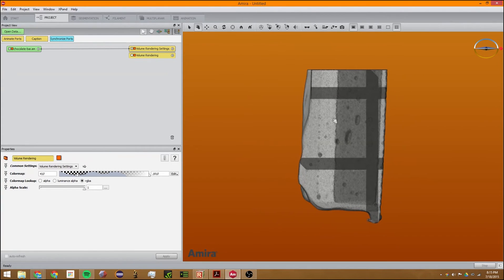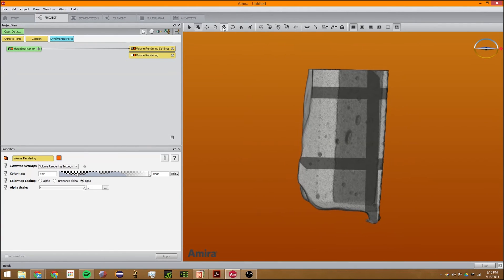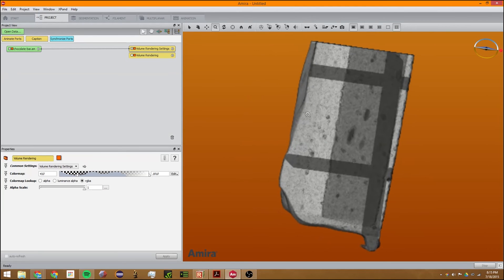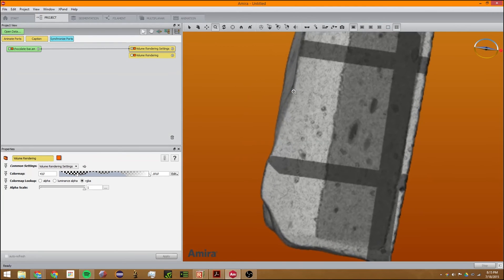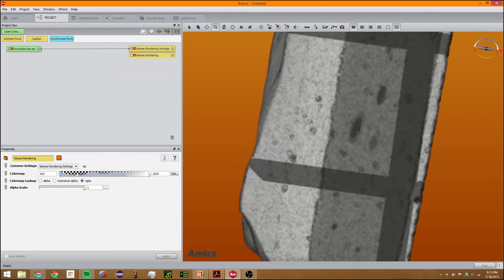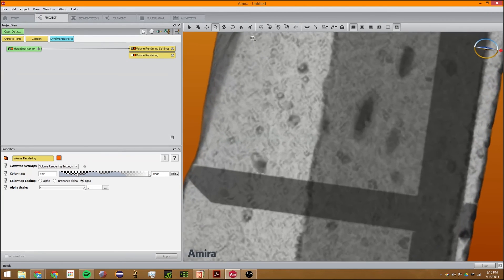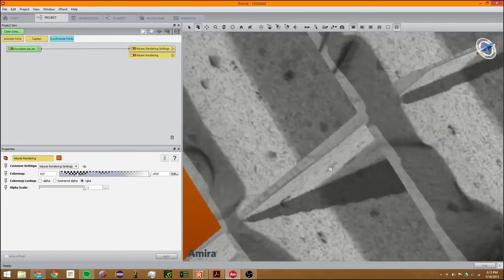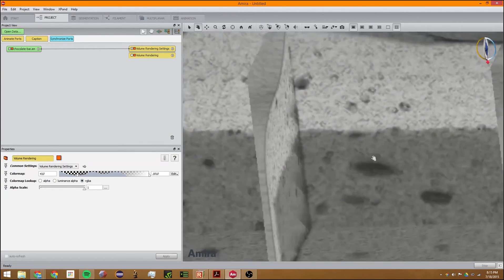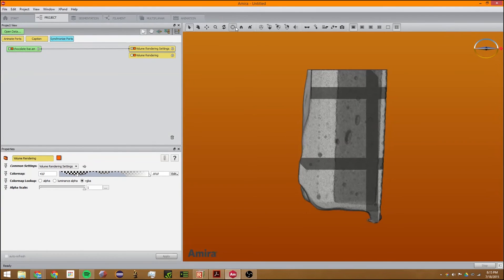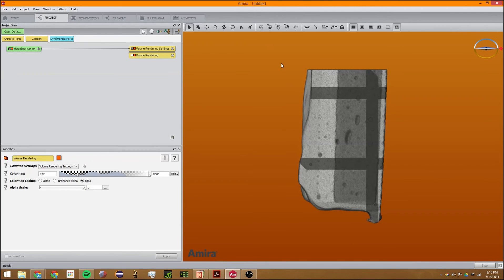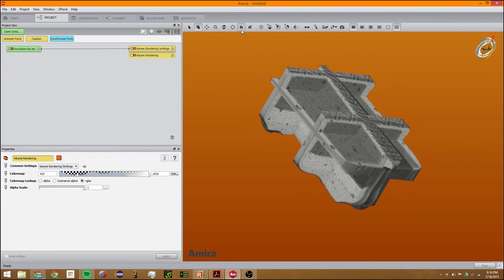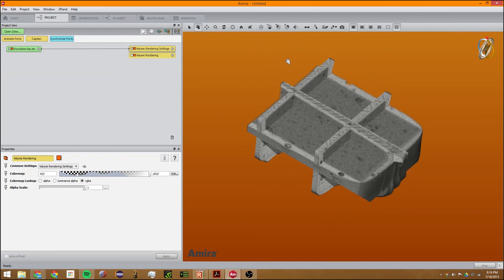You can zoom in on a particular part. You can rotate it. You can zoom in by using the mouse wheel and use this to rotate. You can use this to select different parts, use this to go back to home. This allows you to set the home.